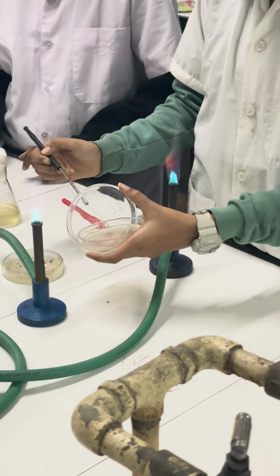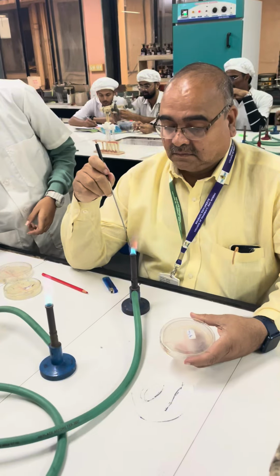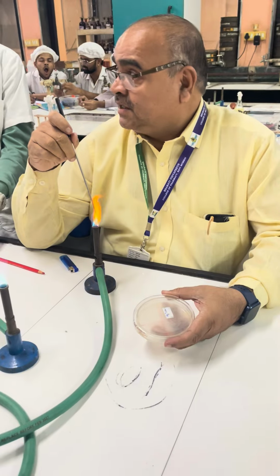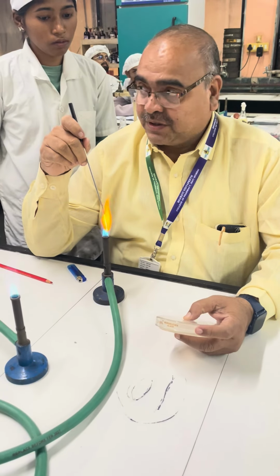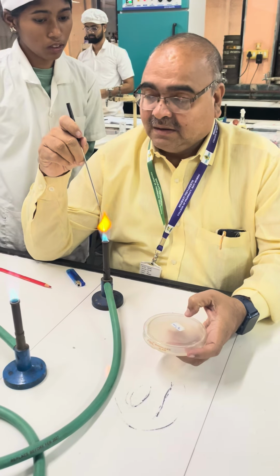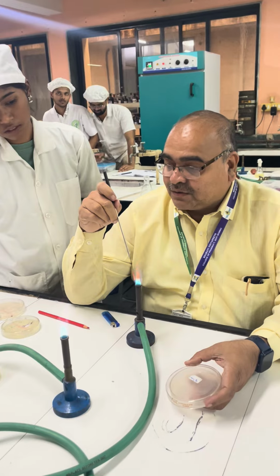Till that time you put litmus paper in that. You have litmus paper, right? You have done the MPN practical. See what you have done. You have streaked half portion. You have streaked this half portion, and in the second loop you have done like this. Now how to do horizontal inoculation? Horizontal line and vertical line. That I will try to show you. Just wait.